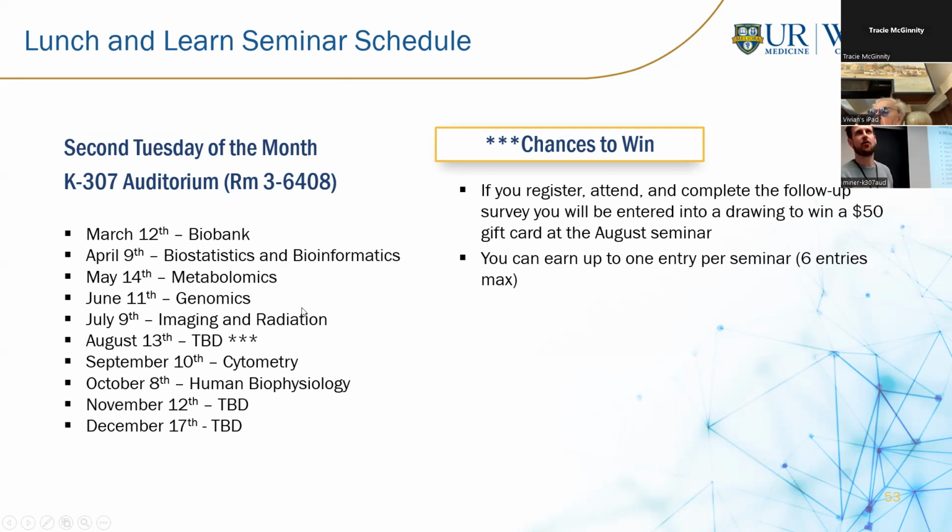What I would say to that is that's only really going to be analyzed and looked into if you're trying to request a rare specimen, right? So if you're looking for a colon cancer sample that's pretty ubiquitous, it's not an issue. But if, say, we only have one tube, one aliquot of whatever tumor tissue or blood specimen left, then we'll put a little more thought into, is this how we want that used, knowing that it's the last one. I wouldn't worry so much about that. It's really to make sure that we have oversight for this process and that we're not losing or wasting rare collections on research that isn't well developed.